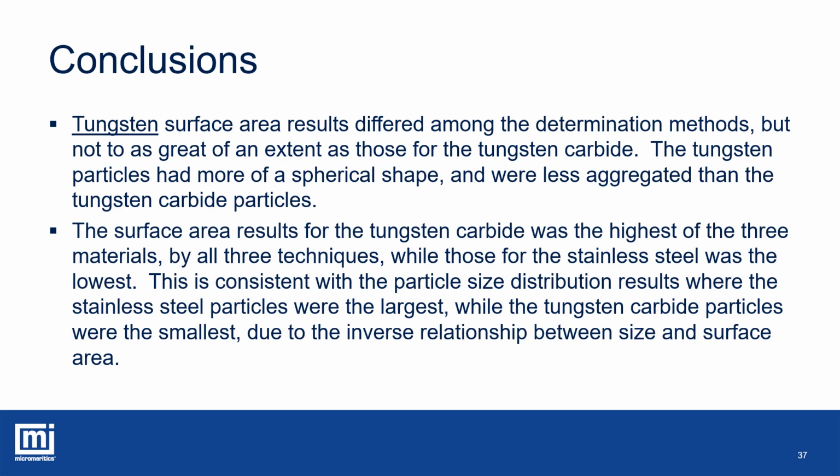This is consistent with the particle size distribution results, where the stainless steel were the largest, while the tungsten carbide were the smallest, due to the inverse relationship between size and surface area.